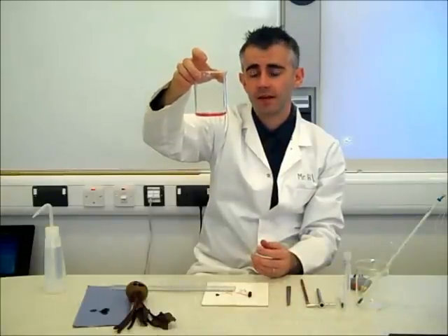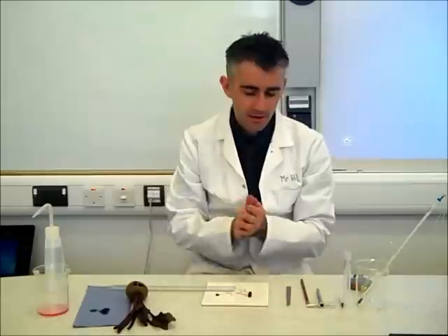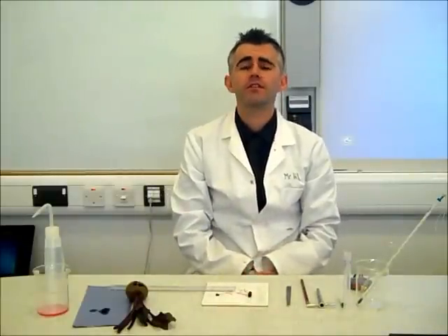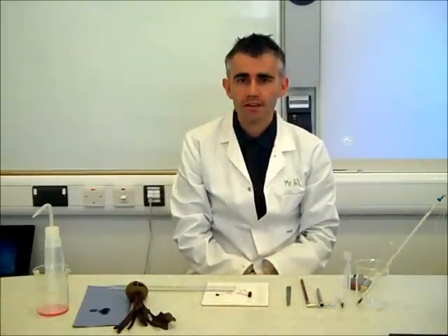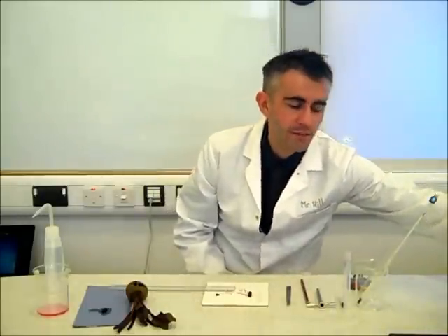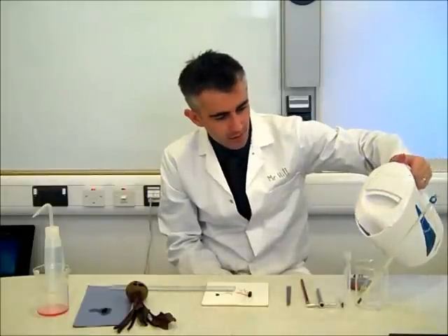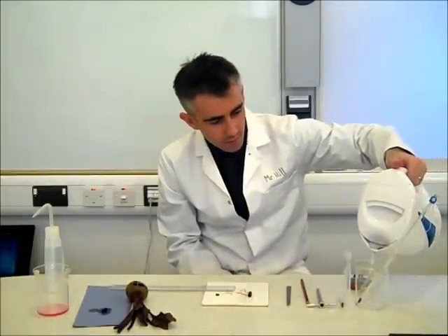Now I'm going to set up my water bath for the temperature. Ideally we'd be using electric water baths to maintain the temperature throughout the investigation. I'm going to make a water bath using a beaker, a boiling tube, and a thermometer. I've got some hot water and I'm aiming for a temperature of 50 degrees Celsius. This kettle has been boiled for a couple of minutes, so let's see what temperature we get.